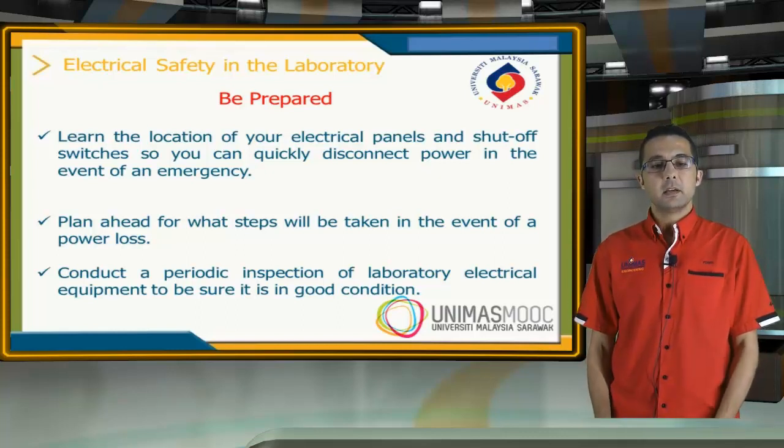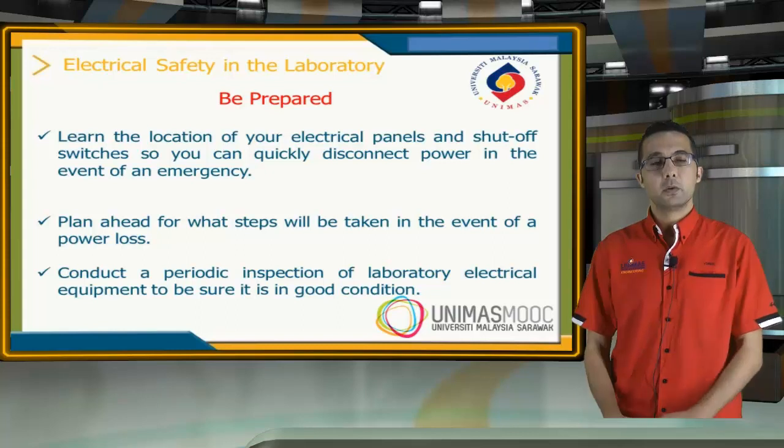Also, conduct periodic inspections of the laboratory equipment to make sure it is in good condition.